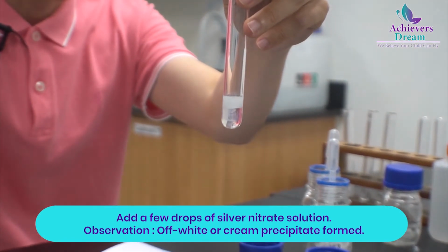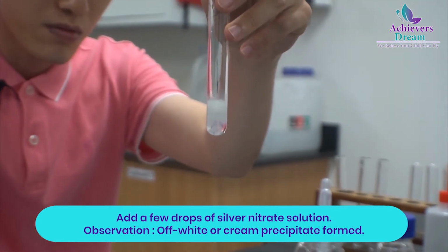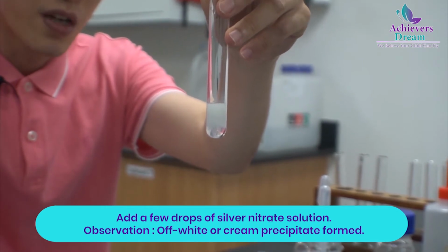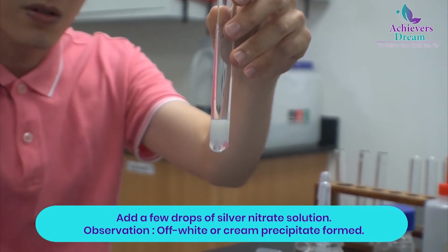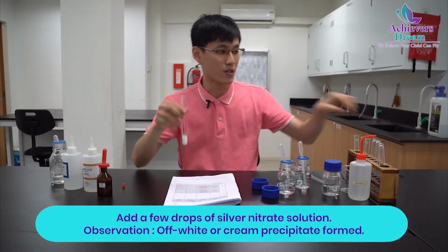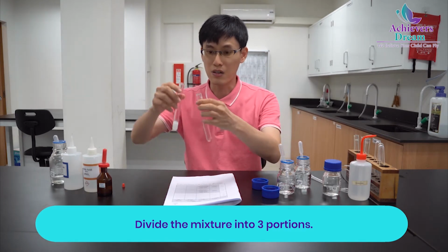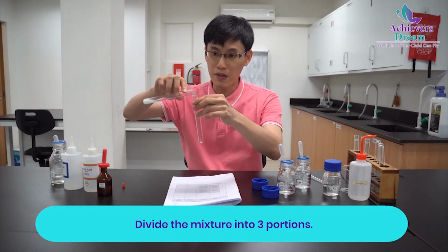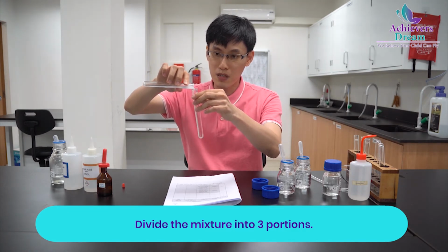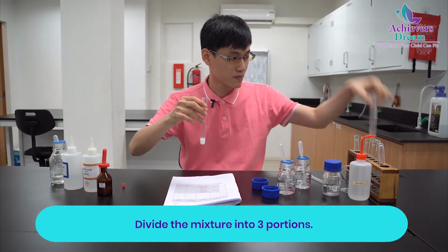Oh, a white precipitate. It's a bit creamish though. It looks white or cream. We can't really tell. That's why we're going to add ammonia later. Because you can recall, silver bromide is soluble in concentrated ammonia, but not in dilute ammonia. So now I'm going to do the same thing. We're going to divide the solution into 3 portions.